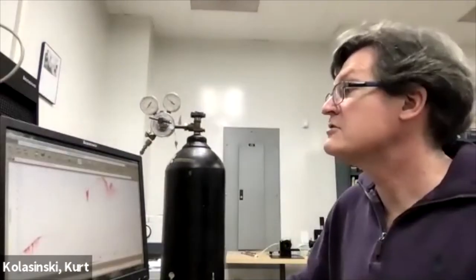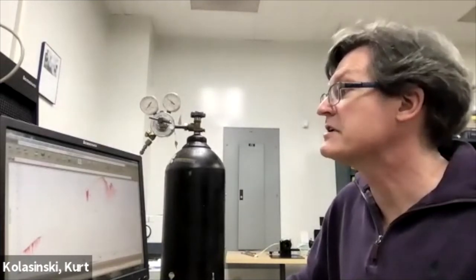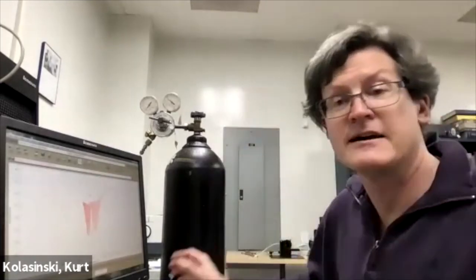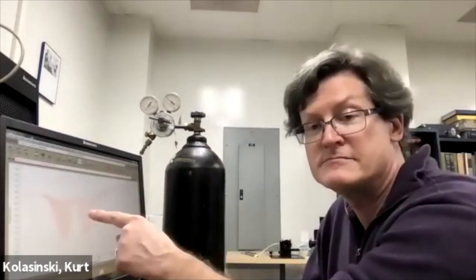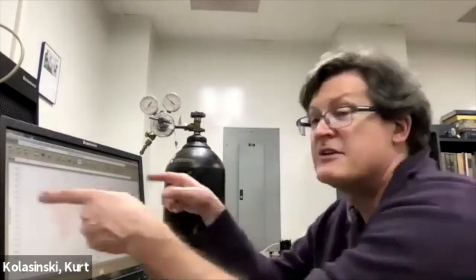Now, when I showed you that, you could zoom in on a region by selecting it and clicking expand. We can zoom in even more and you'll see those. If you zoom in and you save, it will only save this portion of the spectrum. It only saves what is in red.